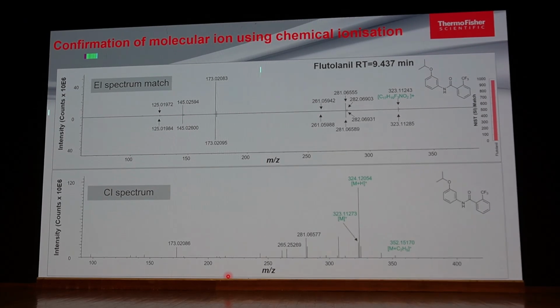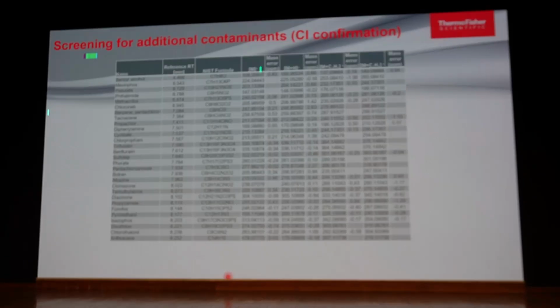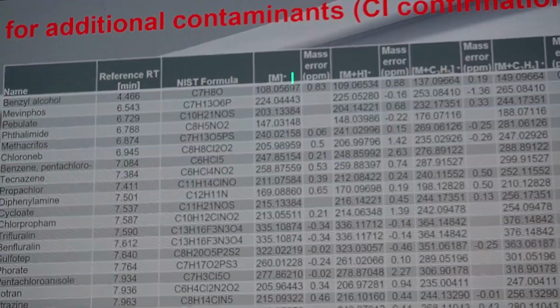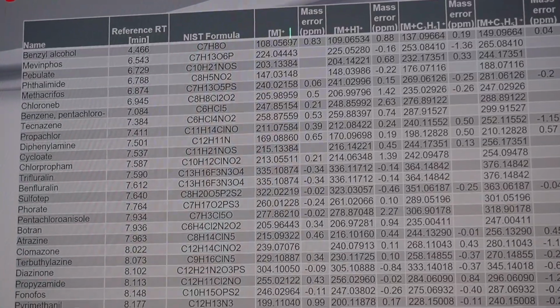So based upon that you can try to correlate which is your target, and based upon that target you can get it further confirmed through the structural interpretation of that same structure, as a theoretical structural fragmentation pattern versus observed. You can get that matched fragmentation structure, and based upon that you can calculate the calculated formula information also.